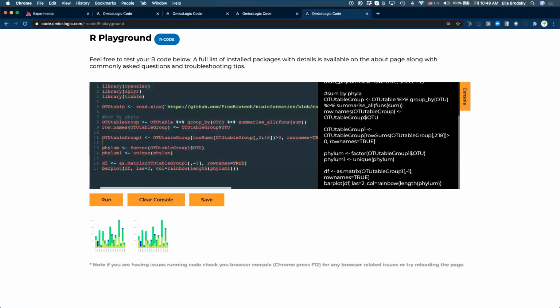Okay, so let's quickly get to making a group. Okay, we won't worry about making this plot look nicer. Let's just make a plot for the group. So we'll just prepare 2 groups. How do we do that? So first of all, we need to create those 2 groups.